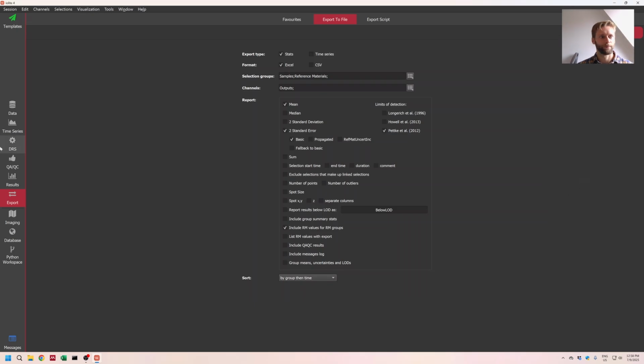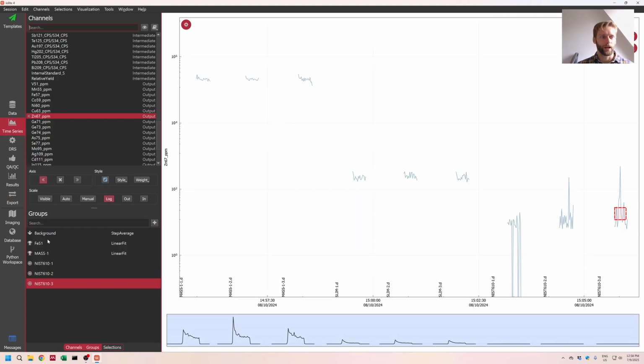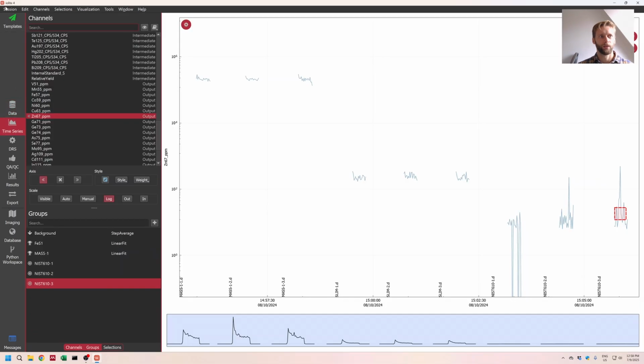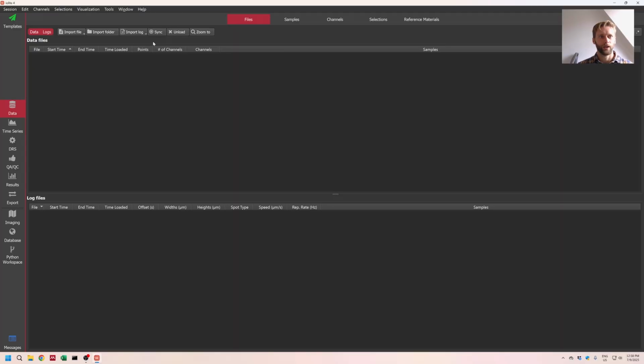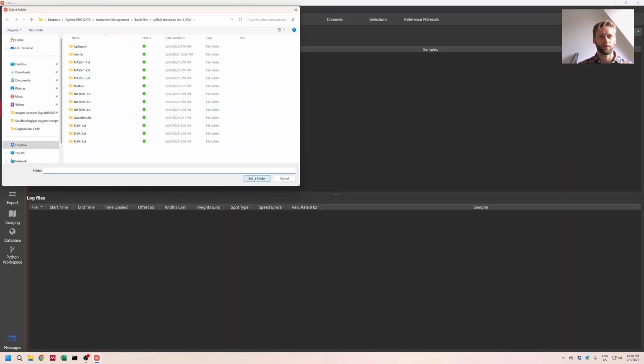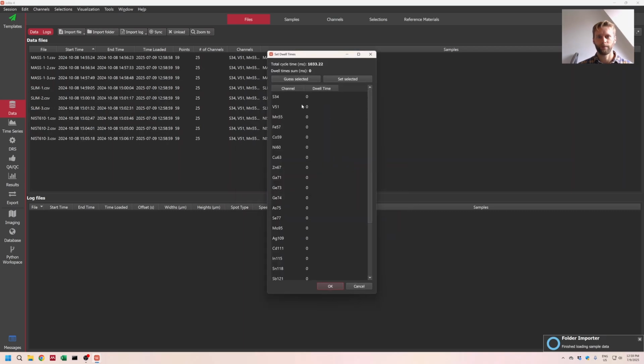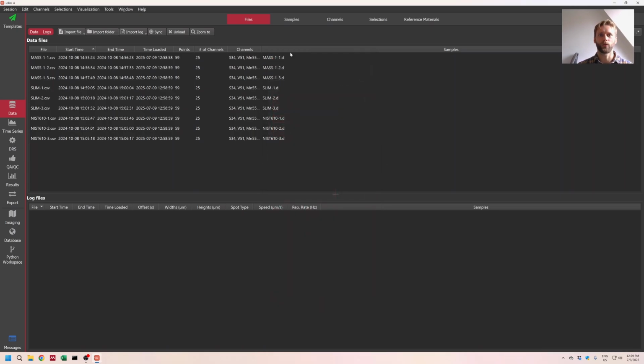How about that? So what should we do? Let's first start a new session and do it over again. So, new session, same thing. Oh no, I've erased all my work, right? Not really. It's pretty easy to go back to where we were before if we don't do everything by hand.